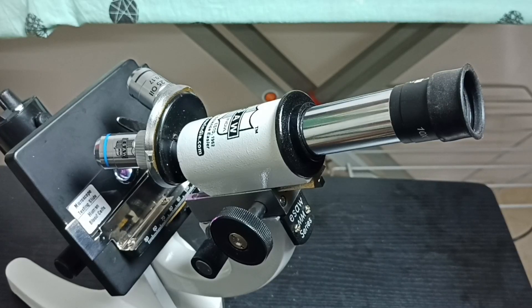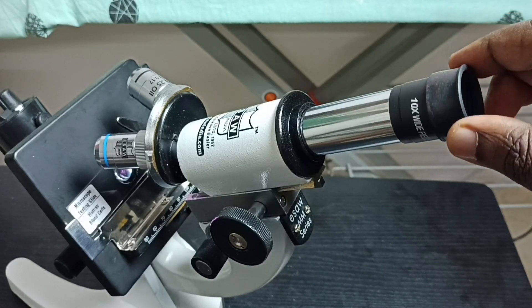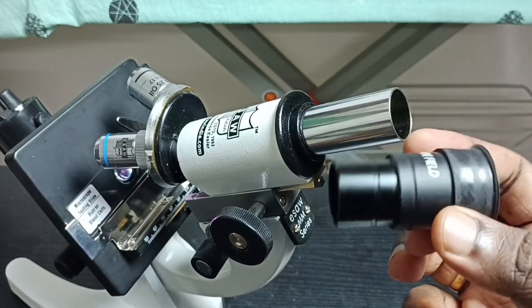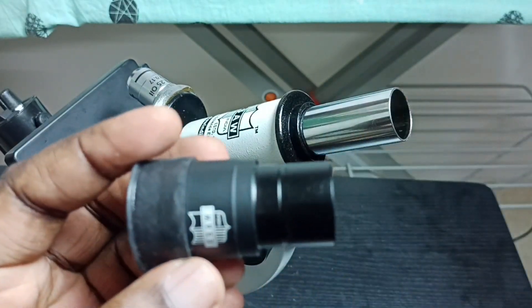Hi friends, this video shows how to open and clean the eyepiece lens of a microscope. This is an eyepiece lens — let me remove it. We can just pull it and take it out.